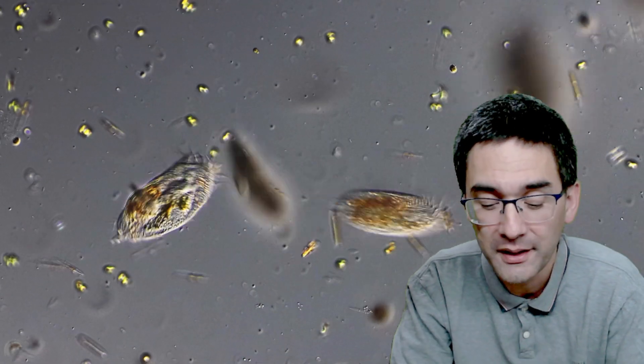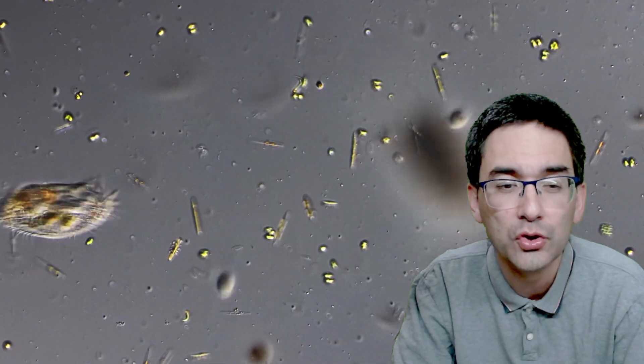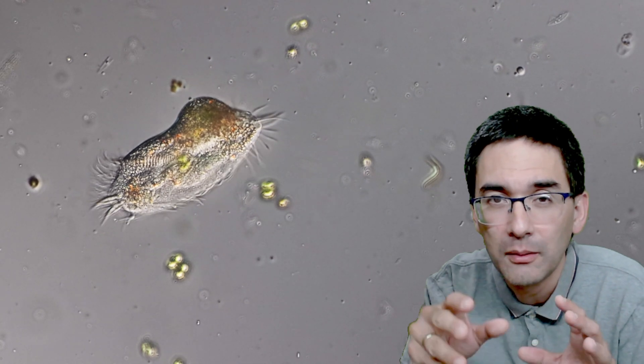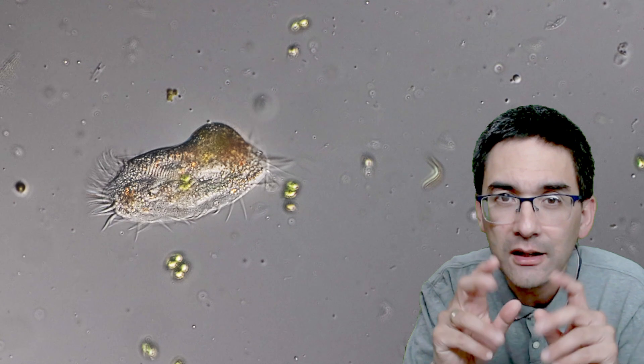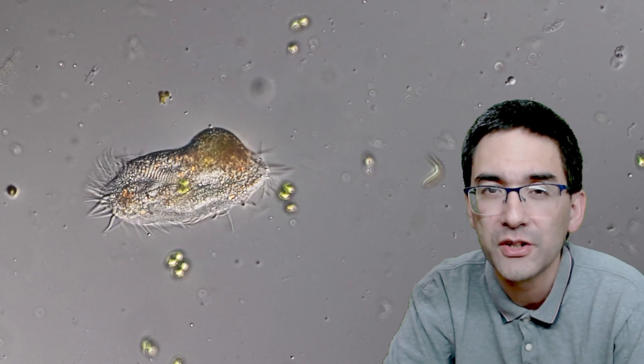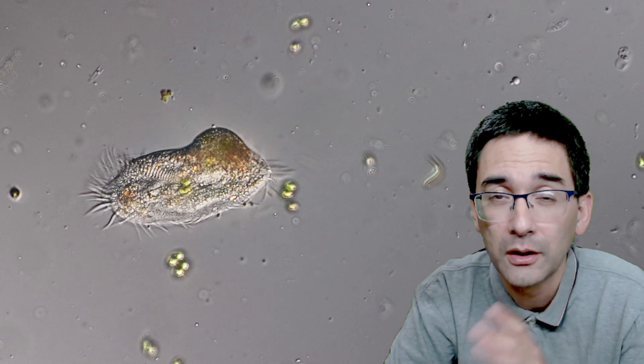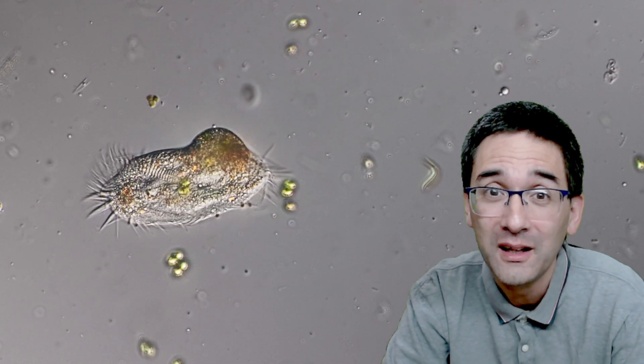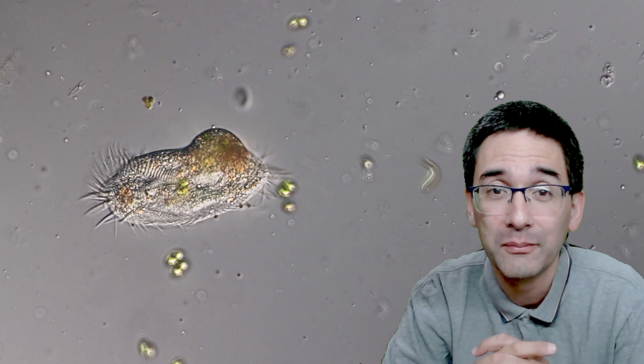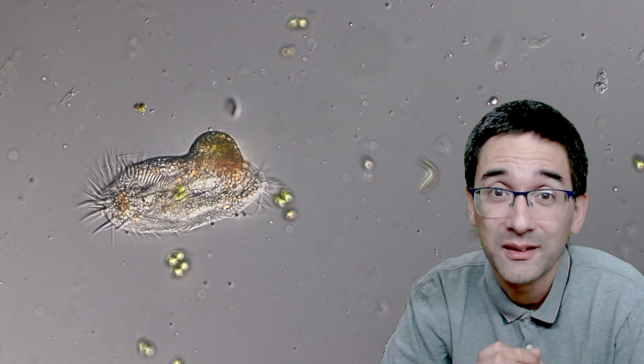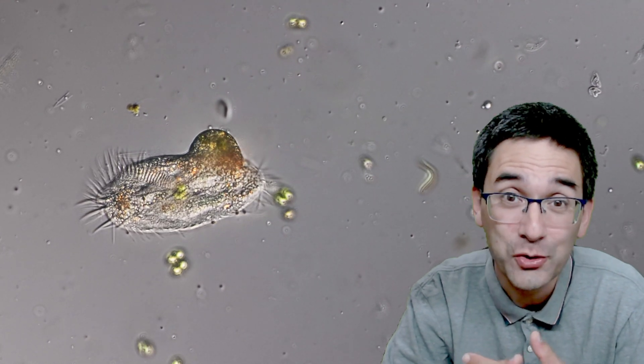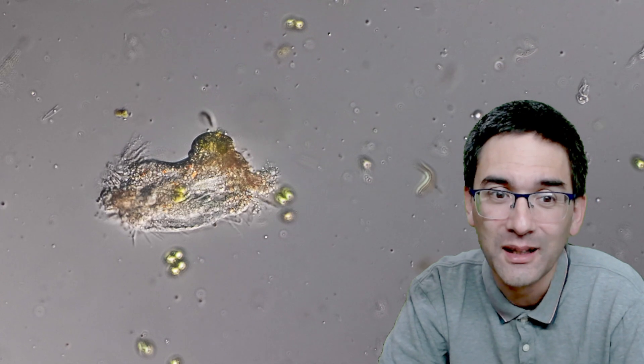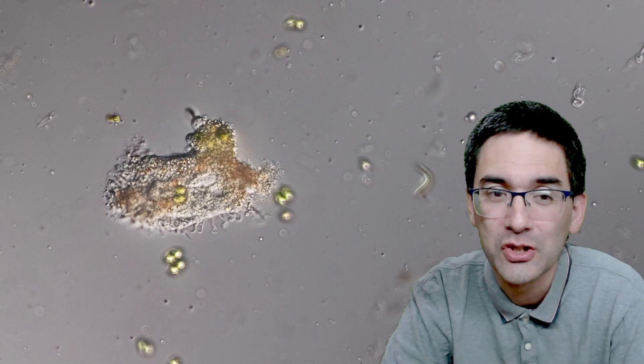I want to show you another clip here—another one in close-up. This is an interesting bulge that you see on the surface of the cell. Look at the movement of the ciliate. At the beginning they still move, then they stop moving. I did not cut the video short or do time lapse, but after a few seconds the cell will break open and the cell's contents will spill out. The cell is then of course dead. You see that in both cases—hydrogen peroxide and the alcohol-containing substance—they work in a similar way. Here you see the cell break open and the cell's content spills out. This is the end of life for this cell.